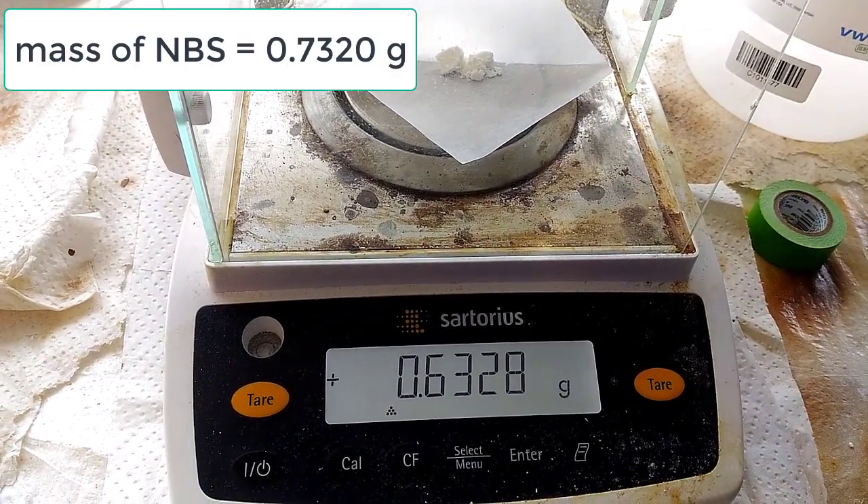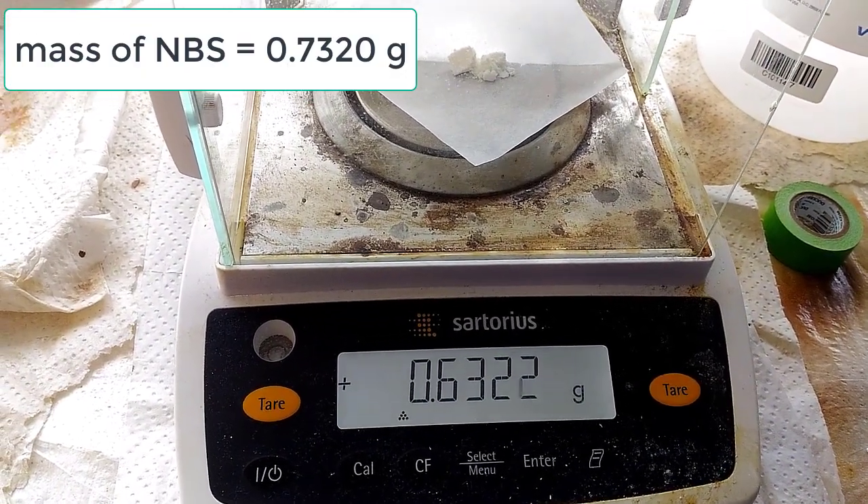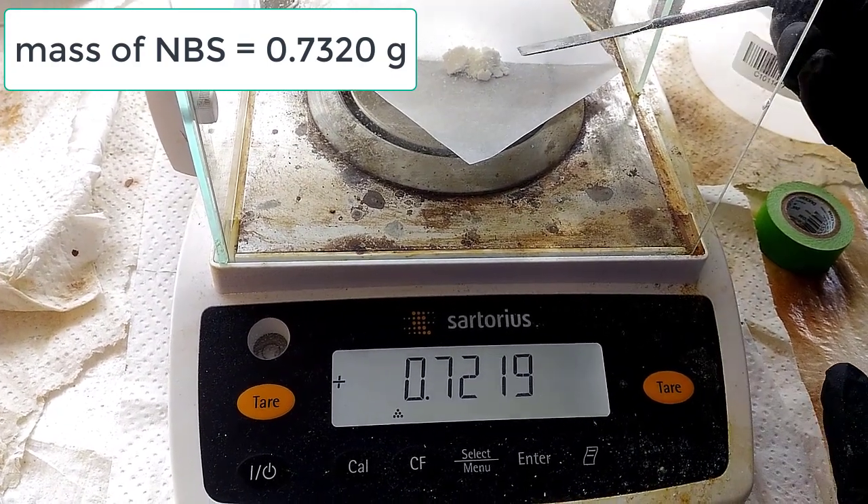Next up, they're going to acquire a mass for N-bromosuccinimide. The mass they're going to get is 0.7320 grams.